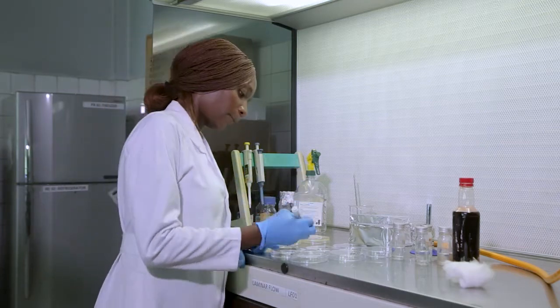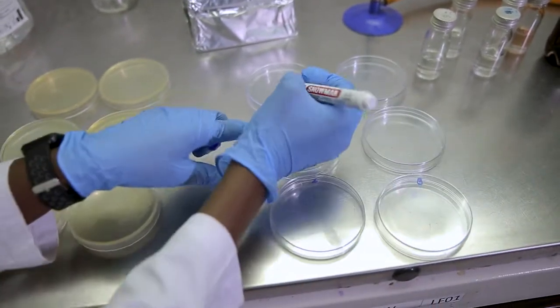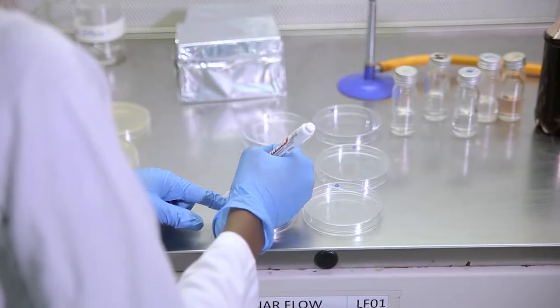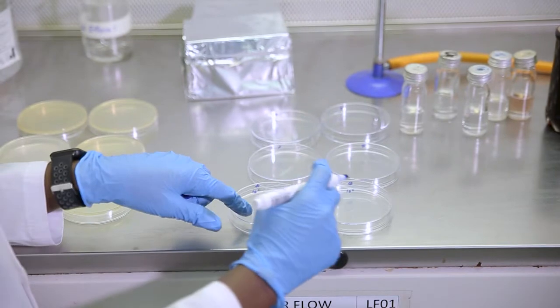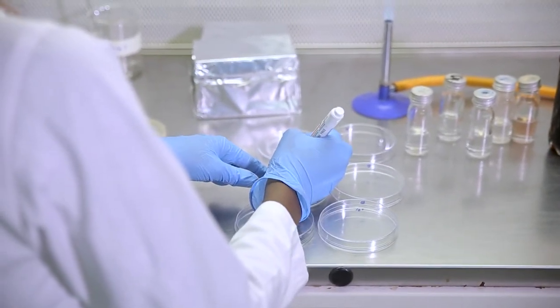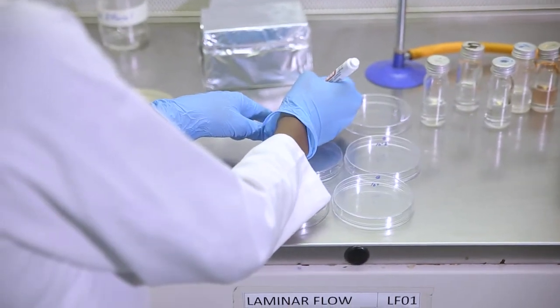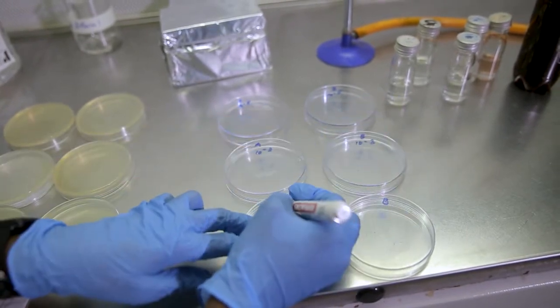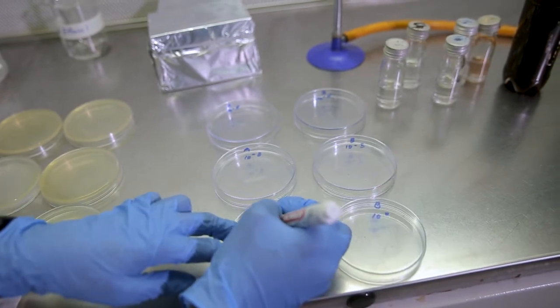So in this case, I'll label my plates A and B, A and B, A and B. On this one, I'll put 10 to the power 0, 10 to the power 0. Remember, it's the same dilution, but we are going to work in duplicates. Then I'll put 10 to the power negative 3, 10 to the power negative 3, 10 to the power negative 5, 10 to the power negative 5. So I have put the replicate A and B, and I have put the dilution.